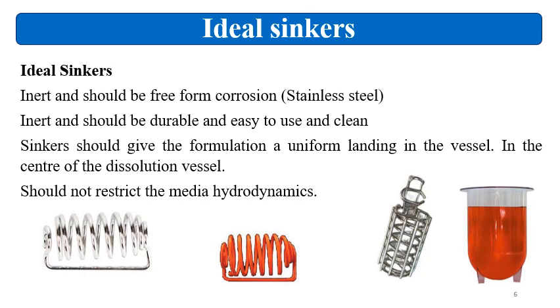Then the sinker should not restrict the media hydrodynamics. If your tablet lands here in the dissolution jar and after 5-10 minutes it goes to the bottom, then results will vary. So these sinkers are taken, the capsule or tablet formulation is kept inside the sinker, and this will go directly to the bottom, because these sinkers have some weight more than the formulation. That's why this allows the formulation to sink to the bottom.